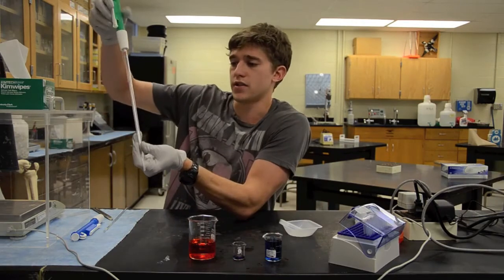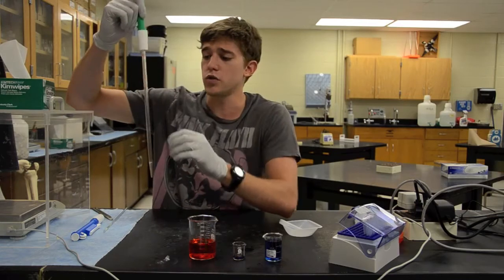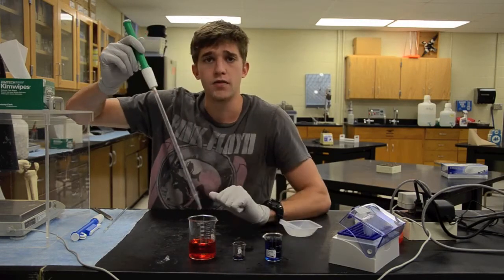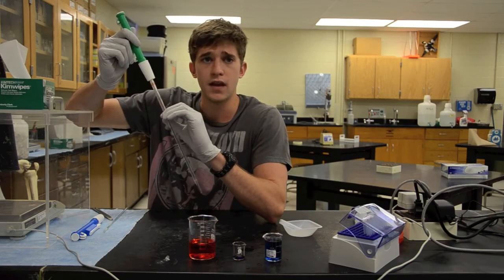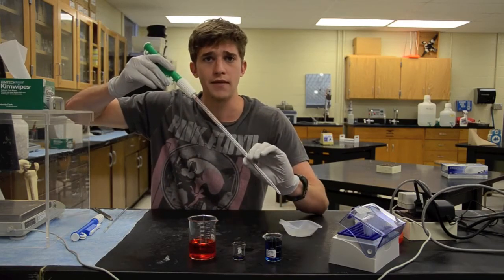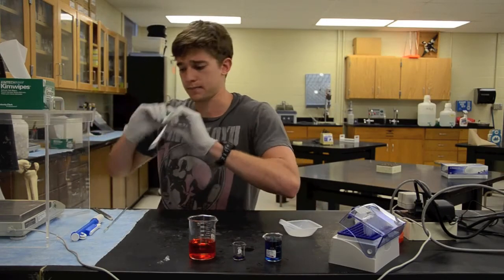But it's also very important to remember how much we're taking out. To do this, we have lots of markings right here. We have one set of numbers that counts up. This way you can easily see how much liquid you're taking up to easily be dispensed. There's also another set of numbers that reads down. This is so if, say, I wanted to take up 10 milliliters and I wanted to dispense 5 into one beaker and 5 into another, I would drop to 5 in the first one and drop to 0 in the second one. And that makes the number counting very easy.